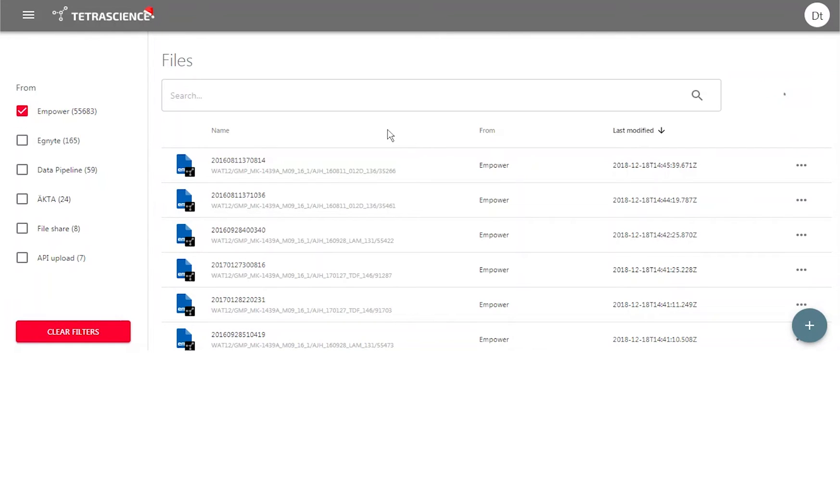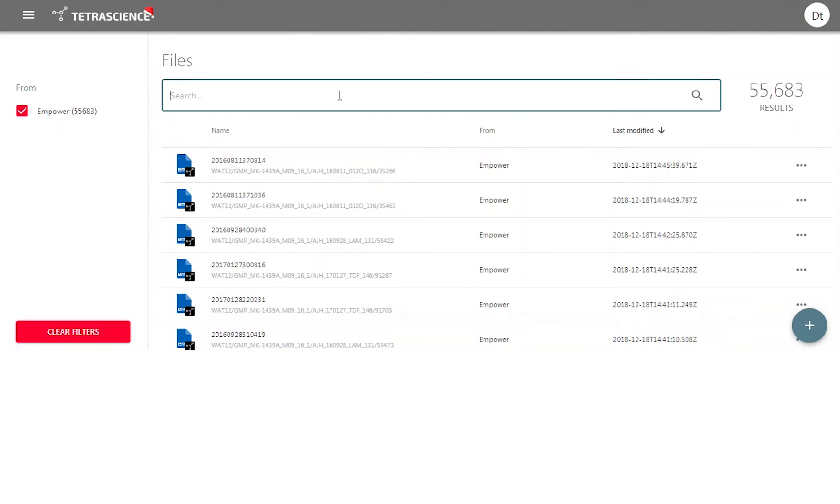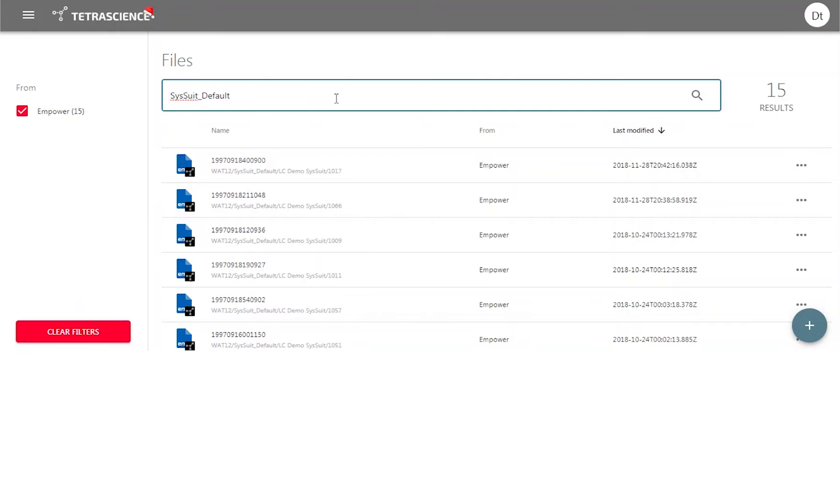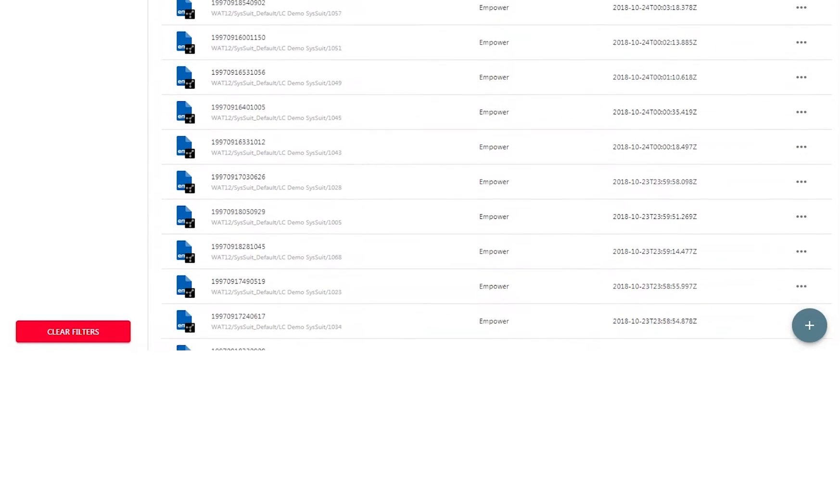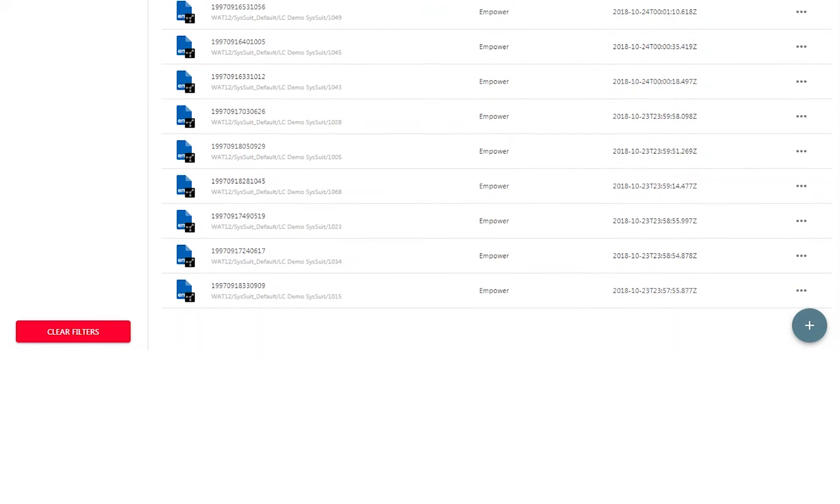We can now see Empower files directly from within TetraScience in our web browser. We can search files by just about any parameter. For example, let's search for the project named SysSuite Default. We see 15 injections belonging to that project.